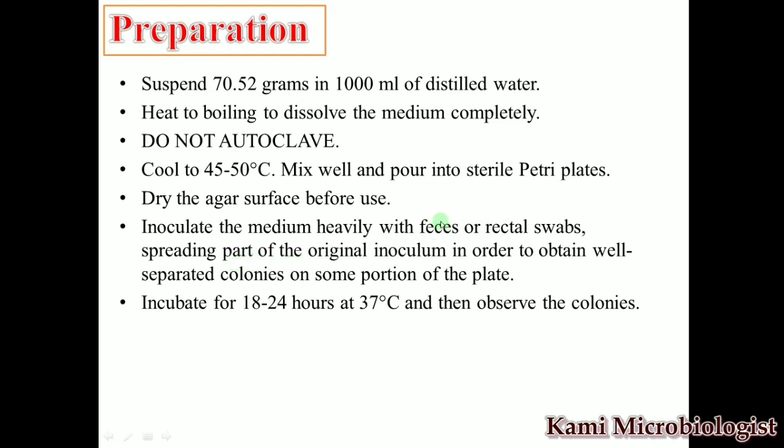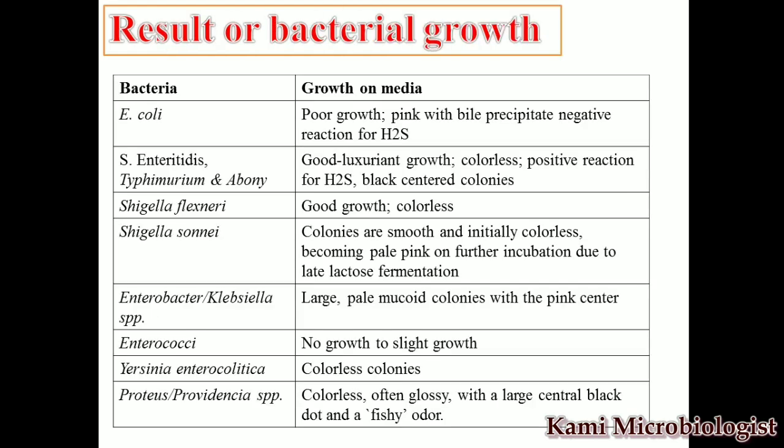From these specimens we will get the bacterial colony, and we will inoculate the specimen into the media, and after 24-hour incubation we will get the bacterial colony. This is how the media is prepared, the culture is performed, and the media is used.